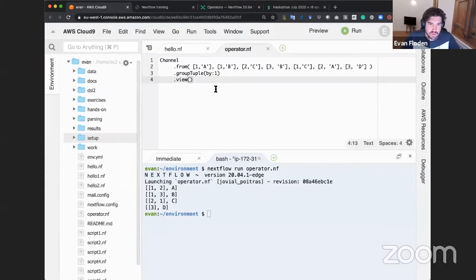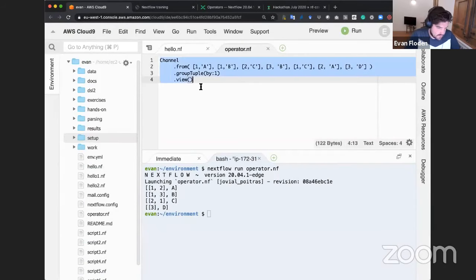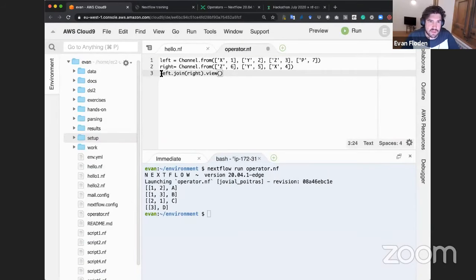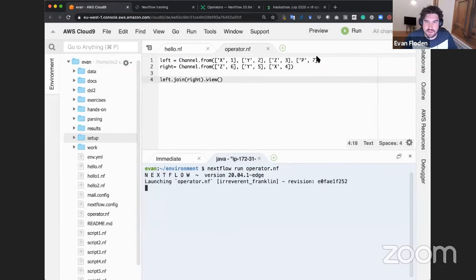So if I was to put into my example, I haven't copied that through, but I'll show you in practice here. Okay, so we define two channels. First behavior here, we are leaving out this remainder. Again, this is so P7 is not there.